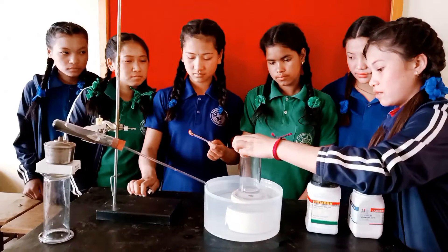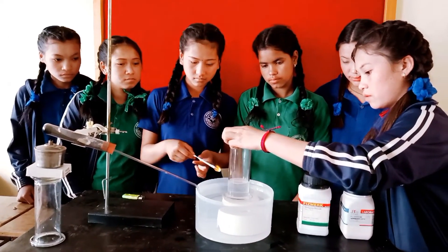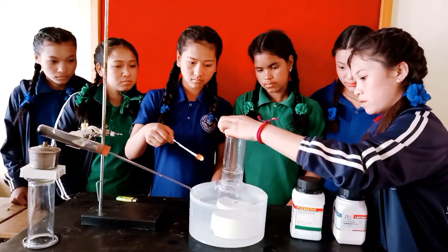With the glowing splinter, we can see that it burns with a more bright light. This proves that the gas in the gas jar is oxygen.